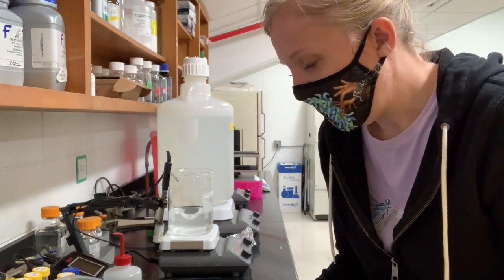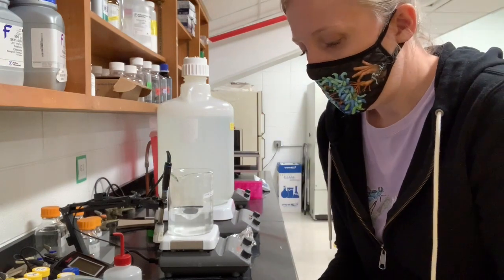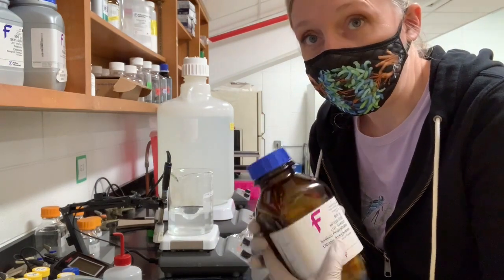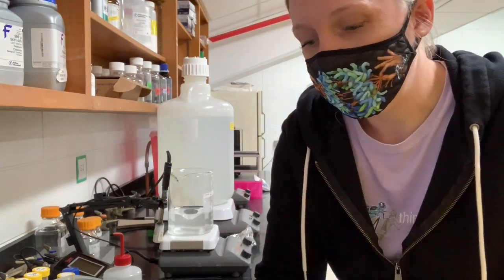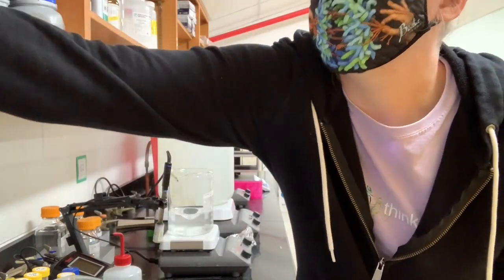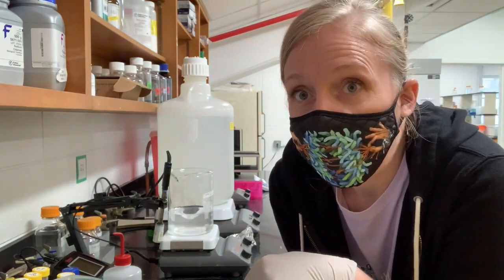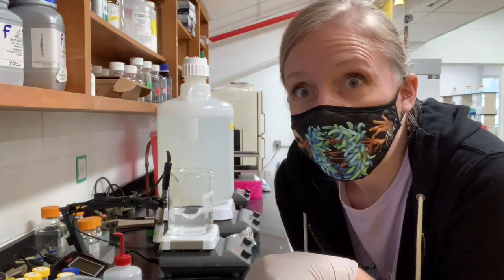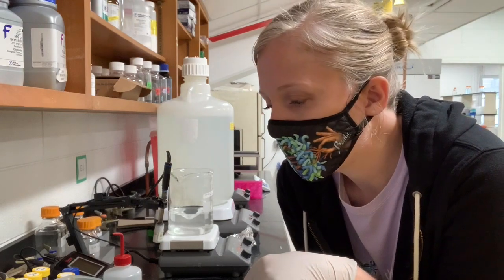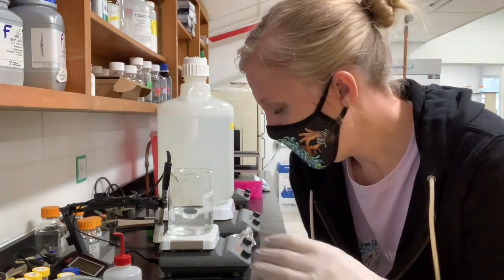So I'm looking for Na2HPO4, and that is the sodium phosphate dibasic salt. The other one says NaH2PO4 instead, the reverse. So both when you're looking for the chemical to grab the molecular weight and when you're grabbing it to add to your solution, make sure that you grab the right one.